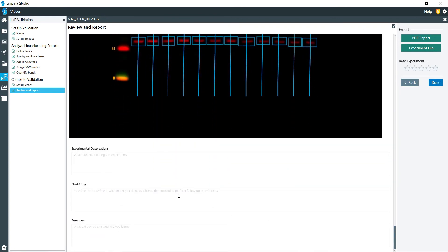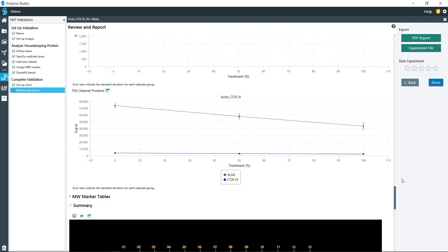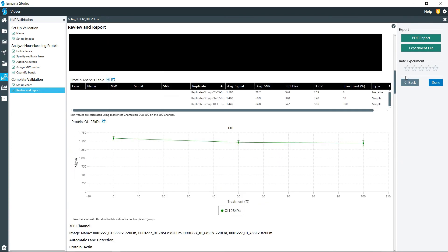Also down here you can add your experimental observations, next steps, and summaries. You can create a PDF report that will create a PDF file of this entire report right here. You can click on experiment file to export this out and take it to another computer for further analysis if need be. Thank you.